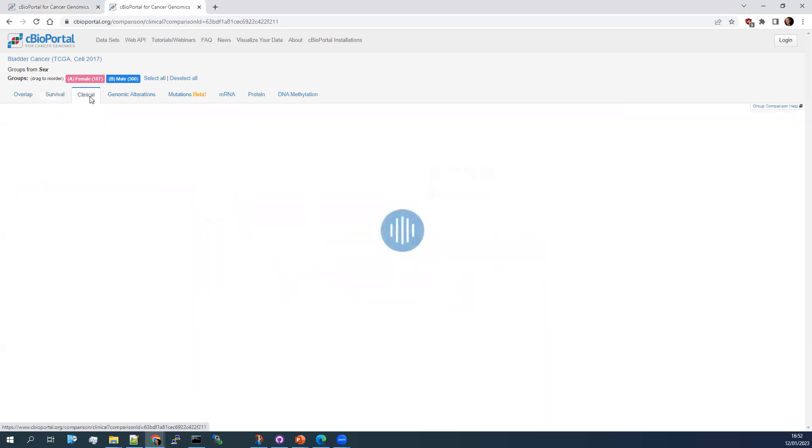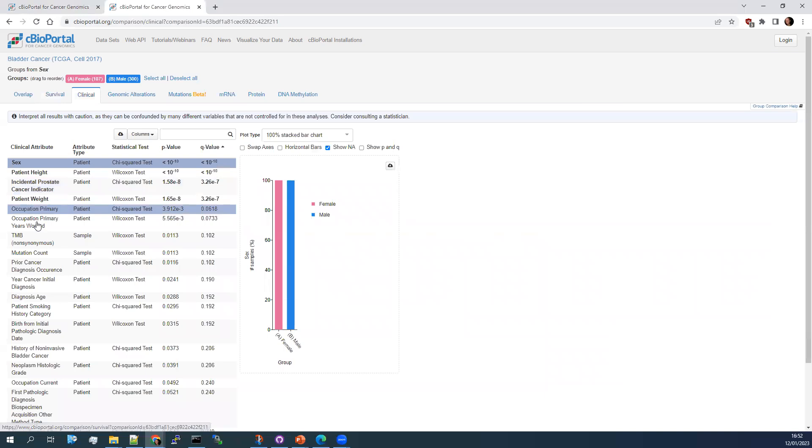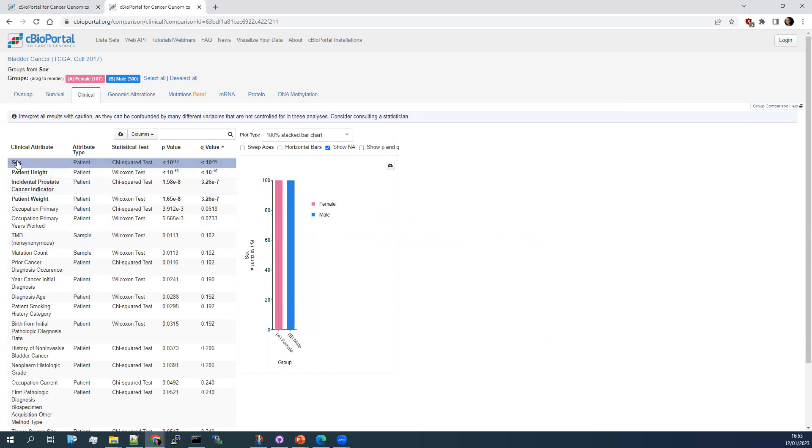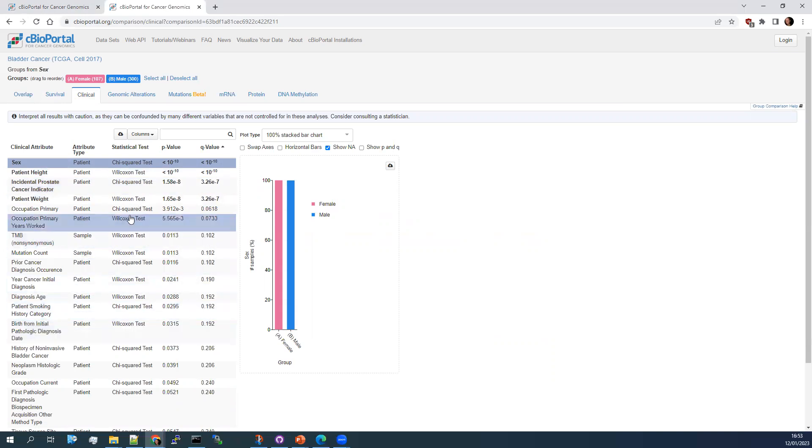You can then go to clinical data. Now, sometimes the clinical data is a bit obvious. So the sex is significantly different between the male and female groups, as is prostate cancer indicators, unsurprisingly. But sometimes you do get things coming out here like differences in smoking or differences in age, mutational burden that might be interesting for your study.